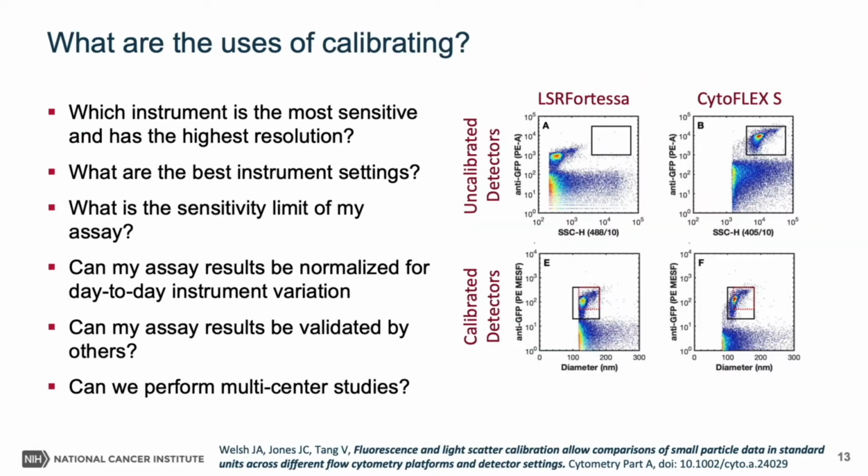So there are many reasons for why you'd want to perform calibration on a flow cytometer. It will allow you to decide which instrument has the highest sensitivity and resolution, quantify which settings are best for any particular instrument.